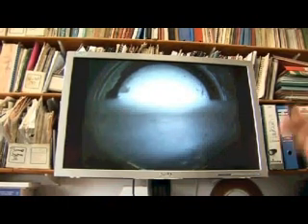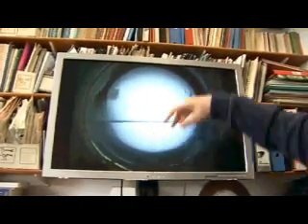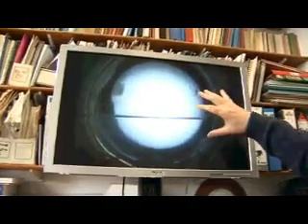I demonstrate this sometimes several times a day if I have lots of visitors, and I still get hooked on this. Now if you're very observant, you'll see there now appears to be less liquid than there was before, because there are still droplets of liquid coming down here.